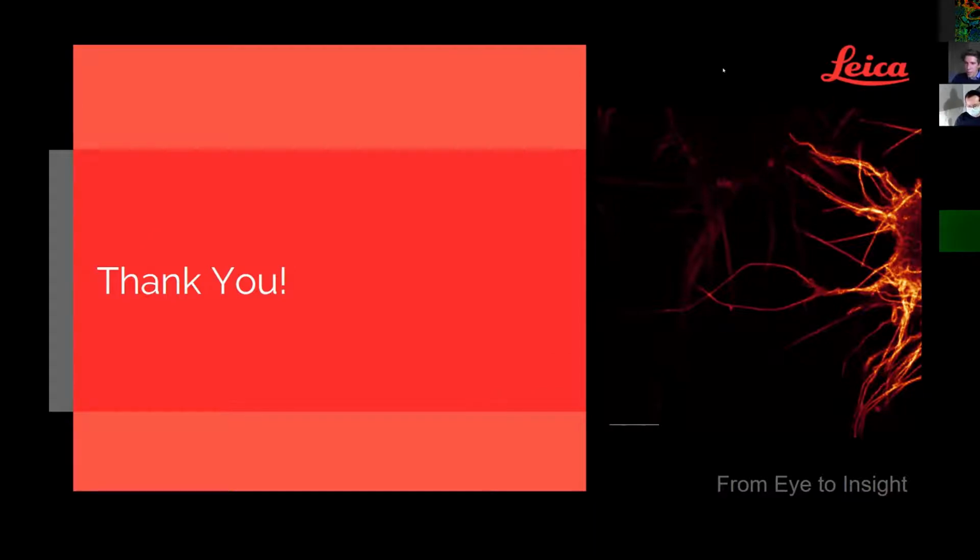I'm not sure if I get the question correctly. In principle, the exposure time or the pixel dwell time is, of course, independent of your STED laser power. You have options, and maybe this is where the question is going. You have options to change the exposure time, the pixel dwell time. You can change the scanning speed. You can change how many repetitions you want to do. You can also work with the resonance scanner for high-speed acquisitions. And that will mainly affect your signal-to-noise ratio, but resolution as such won't be affected by that. I don't know if this answered your question or if I got it correctly, but this is what I would say here.